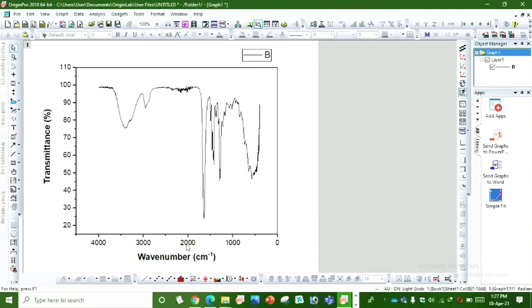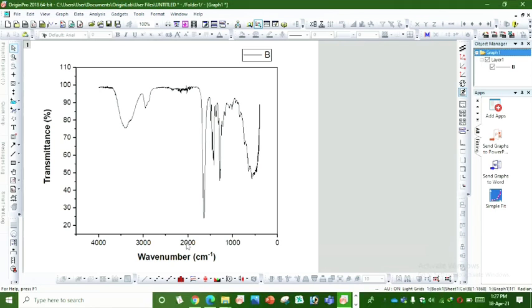Now to see the numerical values in bold form, we click on numerical values.